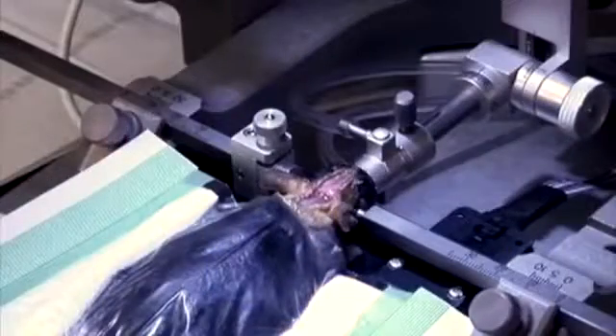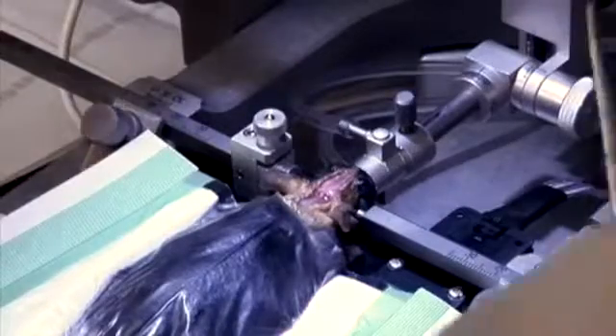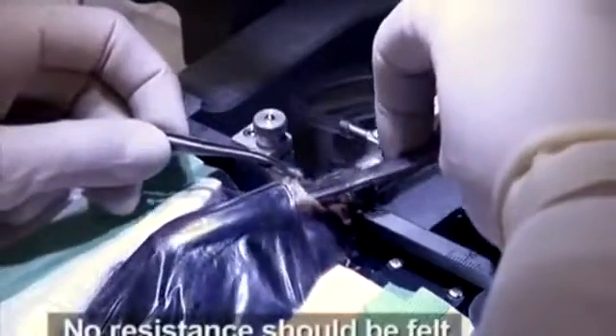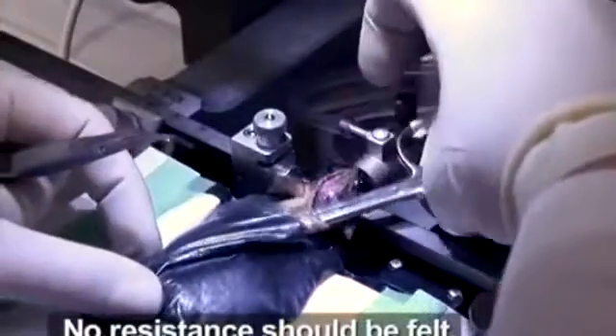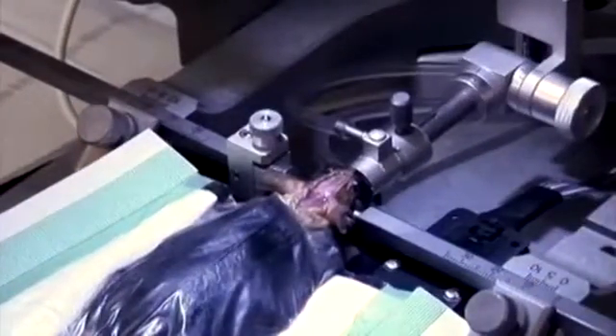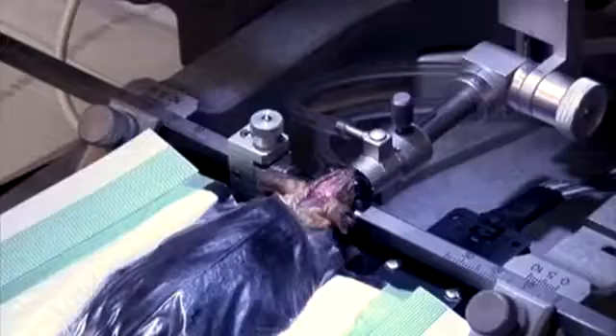After making an incision from the base of the neck to the area between the eyes, insert blunted scissors with the curve facing up underneath the skin at the base of the neck. Smoothly slide the scissors back towards the left hind limb and open them slightly to form a subcutaneous pocket.